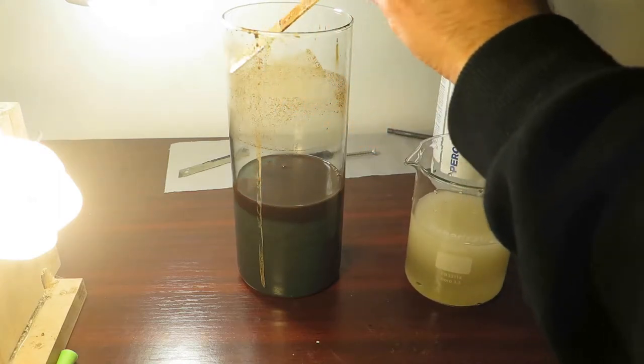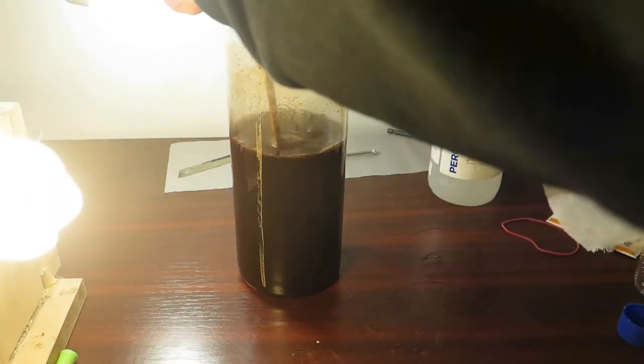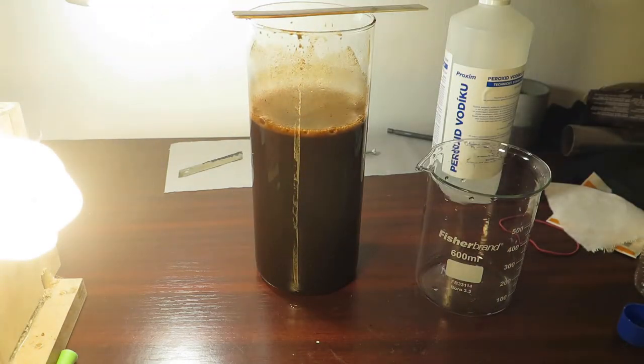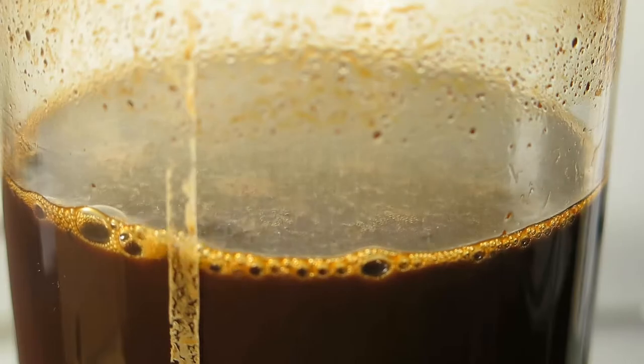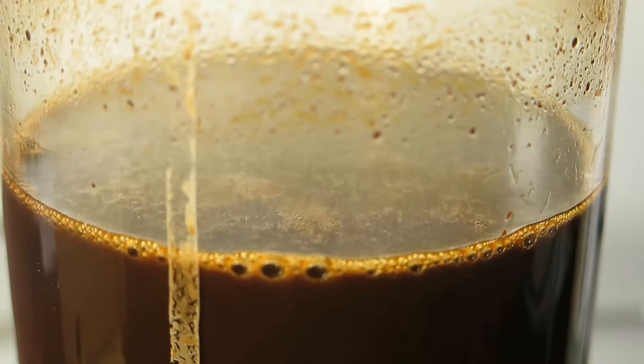And what we are doing here is that we are oxidizing iron-2-hydroxide to iron-3-hydroxide, or iron-3-oxyhydroxide, or what it is. And the chromium-2-hydroxide to chromium at oxidation state 6, so it forms sodium chromate. Iron will remain insoluble, so it's easy to separate it from chromium by simple filtration.